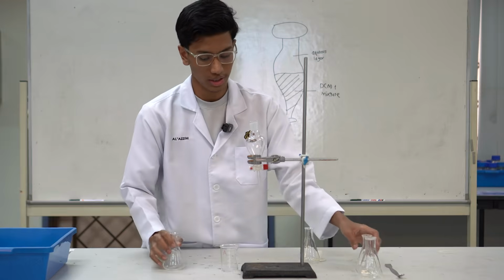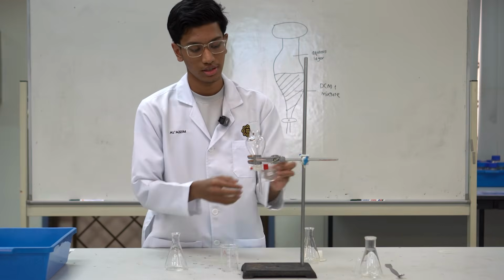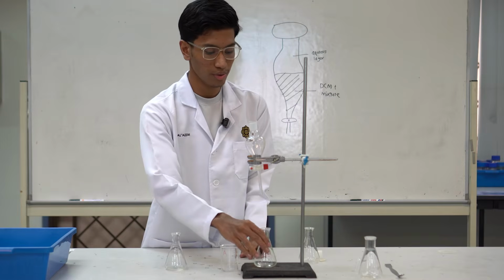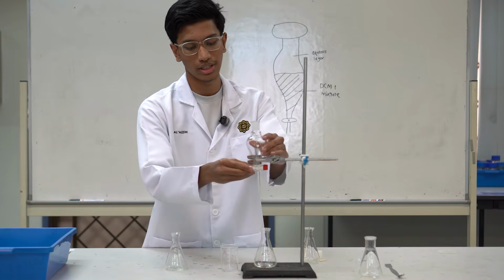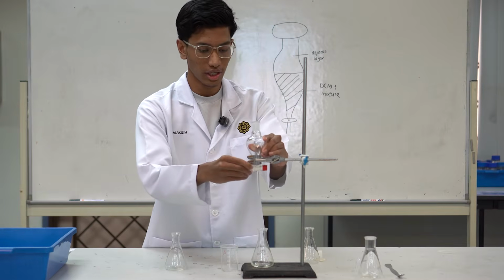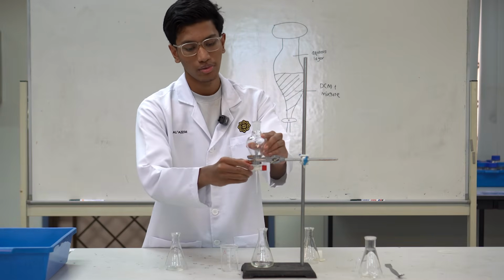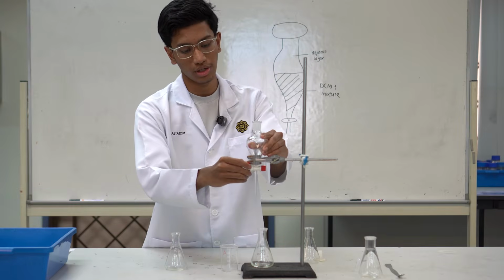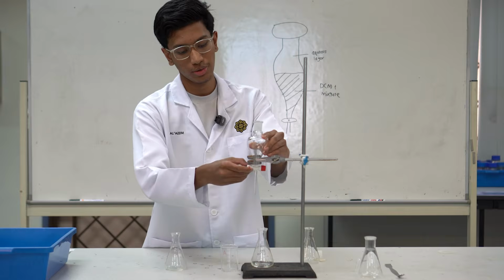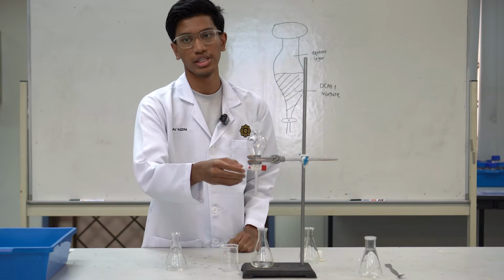And we take an acid flask to place the second layer of the mixture, so that the second layer of the mixture is the pure acid that we need to use, that is a result from a liquid extraction experiment for acid.